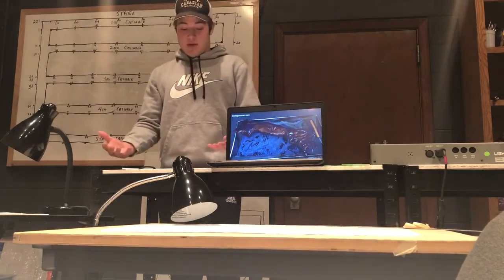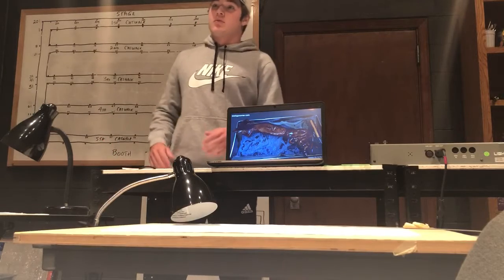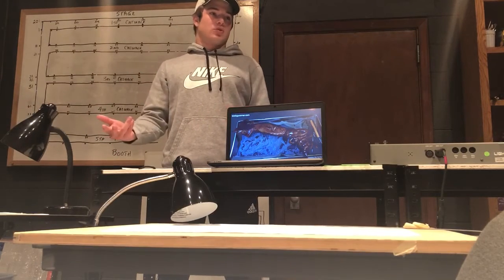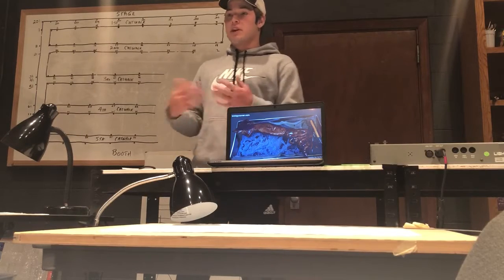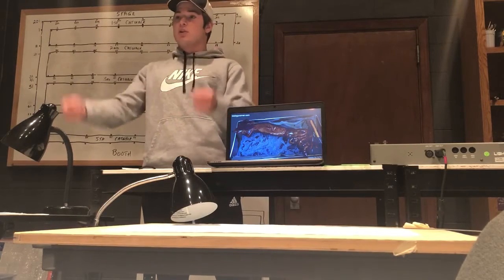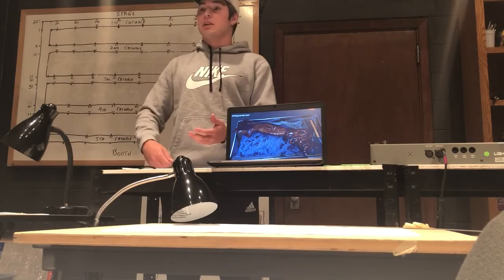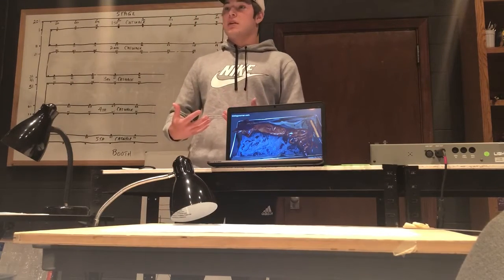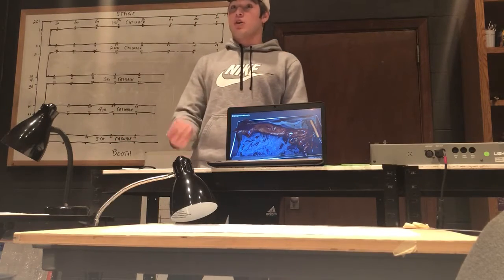Alright, so now we're into the actual experiment of dissecting the squid. Basically what you'll need is your essential equipment: scalpel, scissors, and safety pins. The pins are mainly used after you cut it open to hold down the skin. The scalpel is mainly for cutting the outer skin, and the scissors are mainly used to cut the much thicker, harder things.